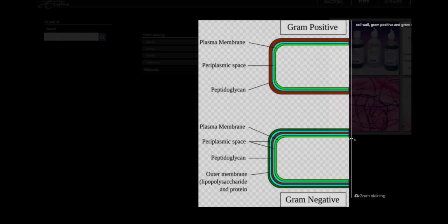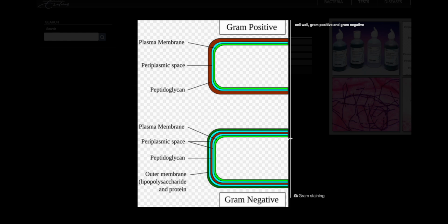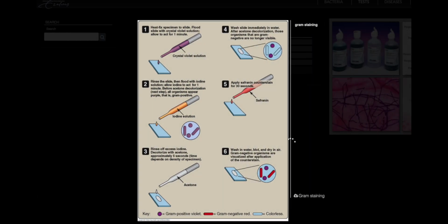Safranine or fuchsin, a counterstain's grace, revealing their forms in a reddish embrace. Through the microscope, a world unfolds, of tiny creatures, in countless folds. Gram's legacy, a gift so grand, to see the unseen, throughout the land.